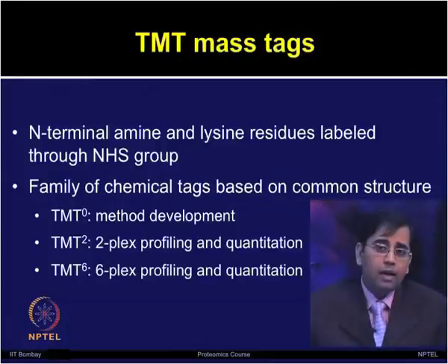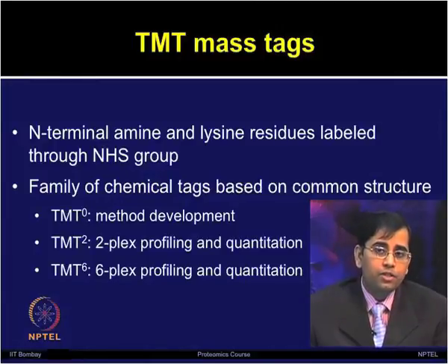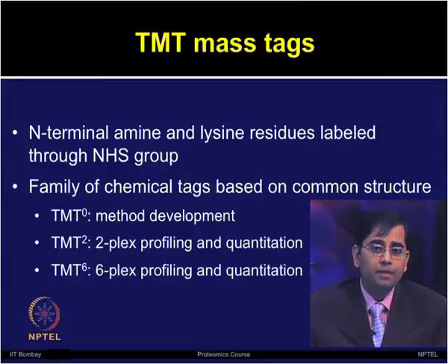The N-terminal amine and lysine residues are labeled through the NHS group. There is a family of chemical tags which are based on common structures. The series of TMT tags available: TMT 0, TMT 2-plex, TMT 6-plex.